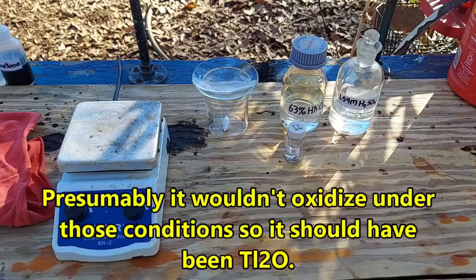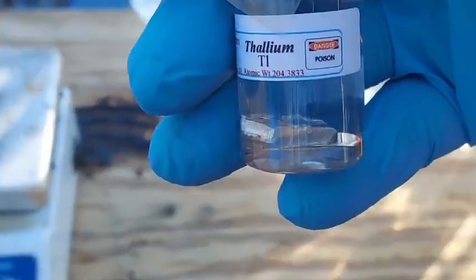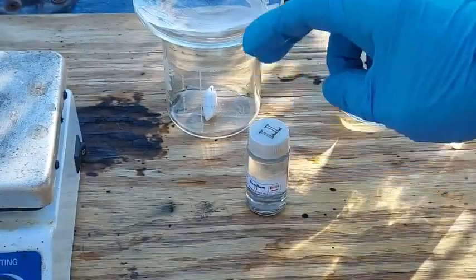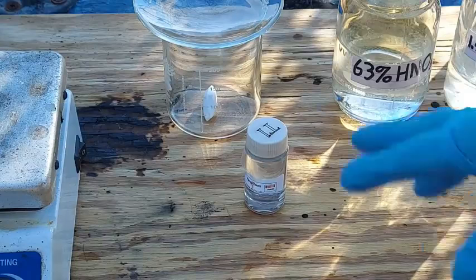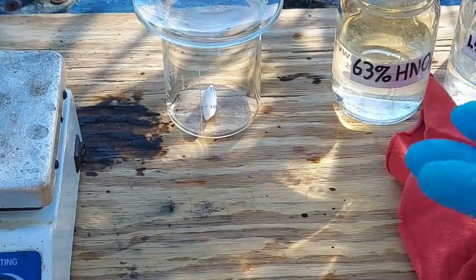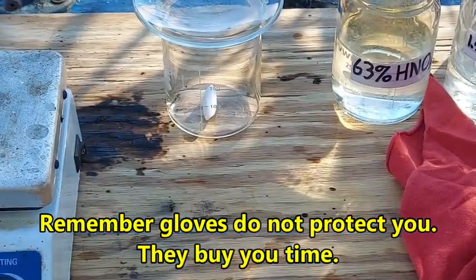So anyway, to do this prep we have 10 grams of thallium here. It's a nice silvery metal — you guys have seen it before, it looks very much like lead. Thallium is active enough that it has to be stored under paraffin oil, so the first step is to remove the thallium from that and get the paraffin oil off of it. Big old chunk of thallium, nice and weighty.